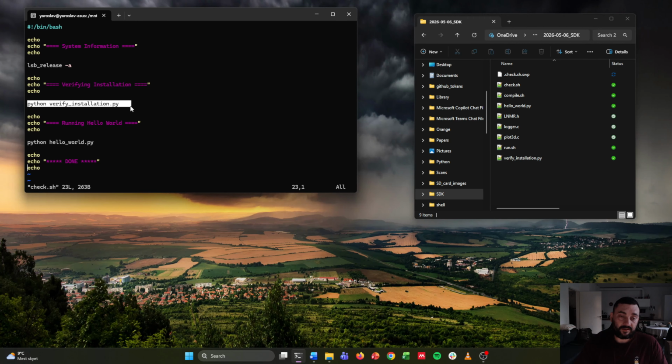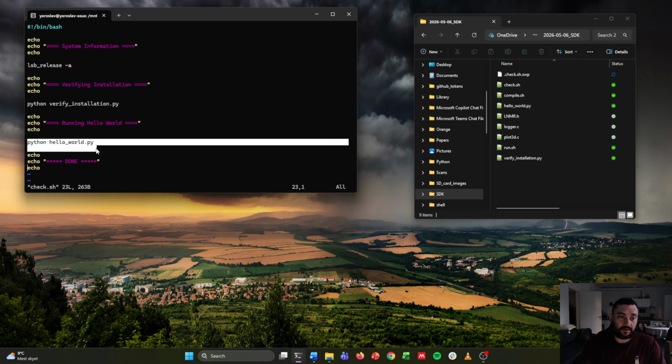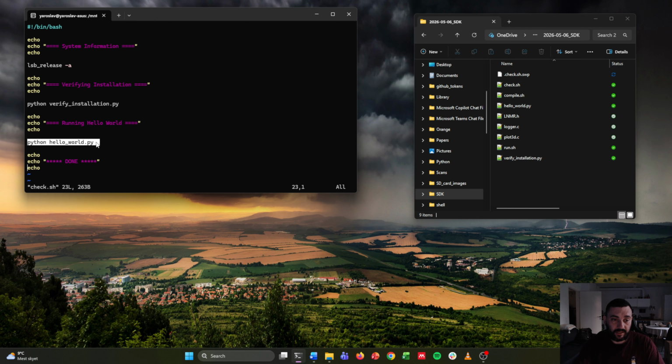We verify the installation and dependencies of packages, and we run a basic Python script from our examples called hello world, which connects to the instrument, performs the handshake, and retrieves basic information such as the firmware version, the serial number of the device, and so on.